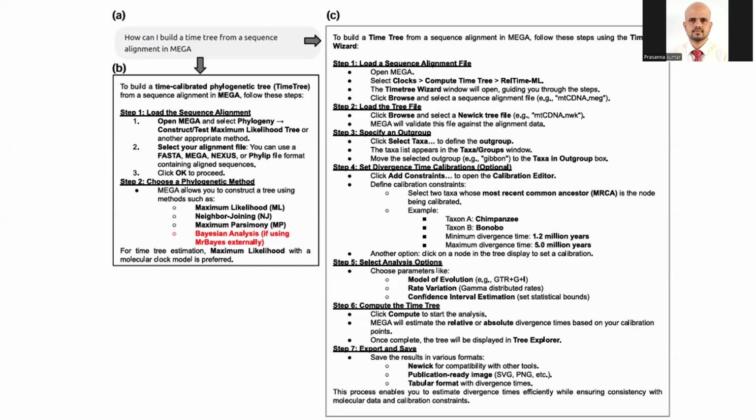So here is a screenshot showing the specialty of Mega integrated GPT. You see, when it is asked to a normal language model, it says many untrue things, many false information, which is not at all present in Mega. But here, Mega along with the GPT has given a clear-cut track of how to build the time tree. Okay, so today's class is all about time tree.